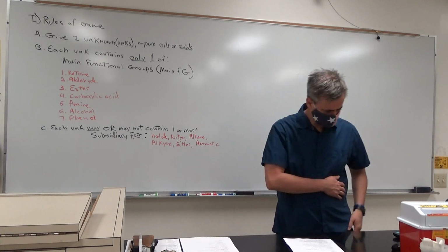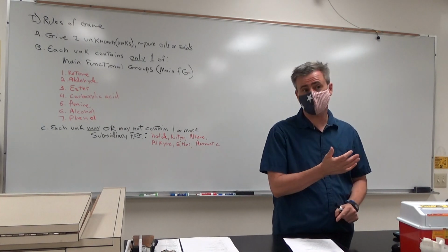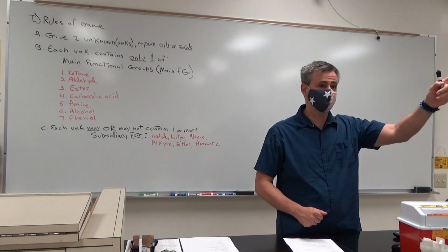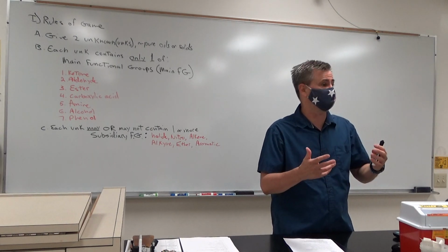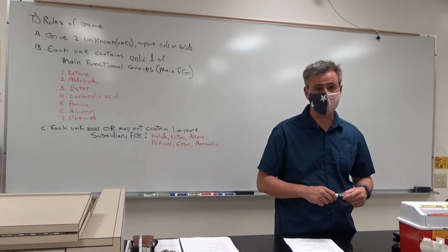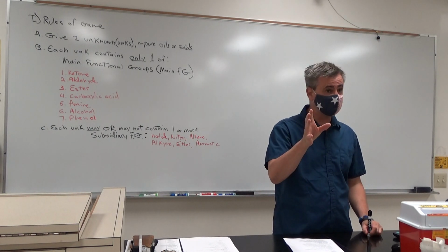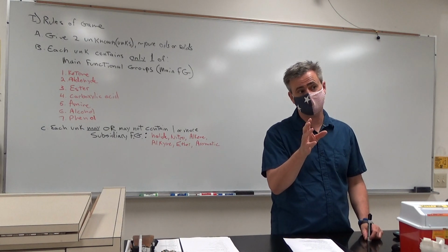And then you're going to take a proton NMR, a C13 NMR, and an IR. IR helps you give confirmation on functional group. That's sort of the point of IR. It's got certain absorptions that you expect to see for certain functional groups. Proton NMR and C13 NMR give you some indirect information about functional group as well.